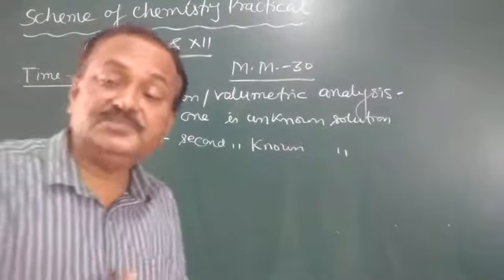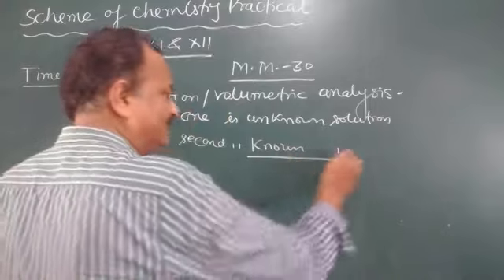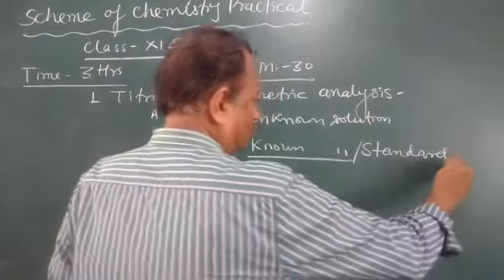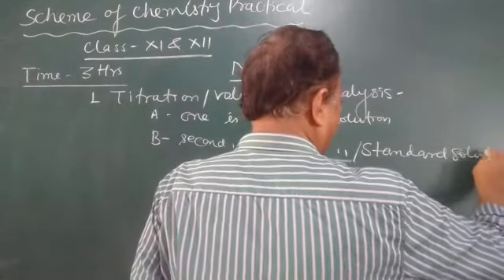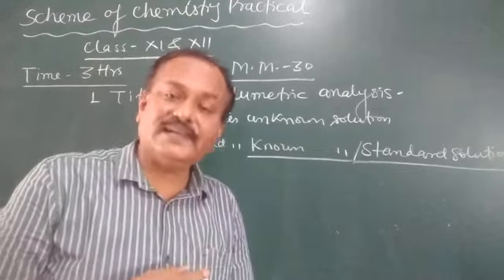The solution which is known is called a standard solution. A standard solution means we know the strength of the solution.